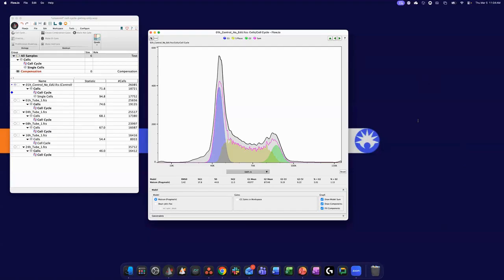Okay, there's another question. Do we need to run the samples with water buffer before we use for cell suspension? I'm not sure I understand that one. Do we need to run the samples with water or buffer? Water buffer. I'm not sure, Haidao, if I understand your question. I don't know if you want to elaborate a bit.